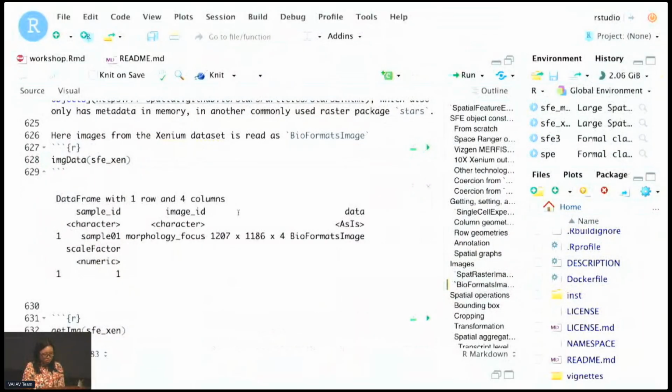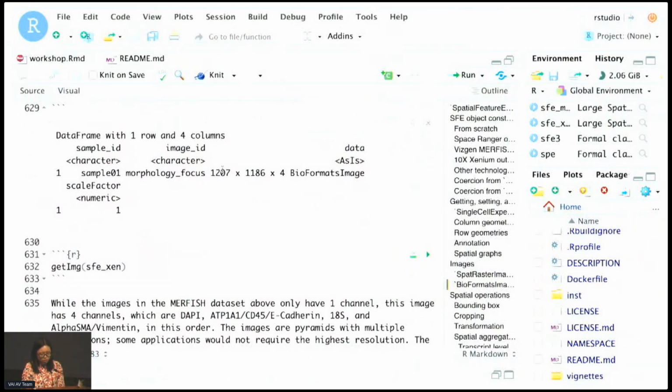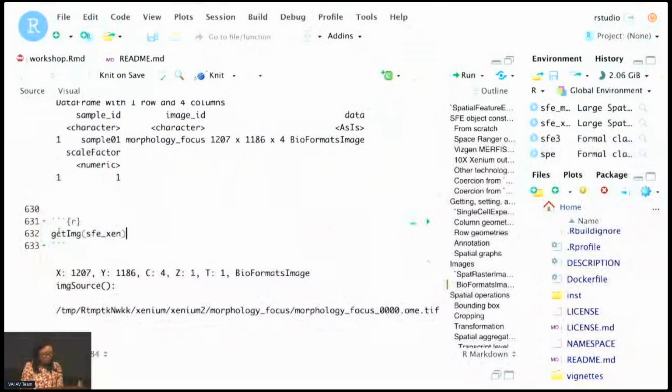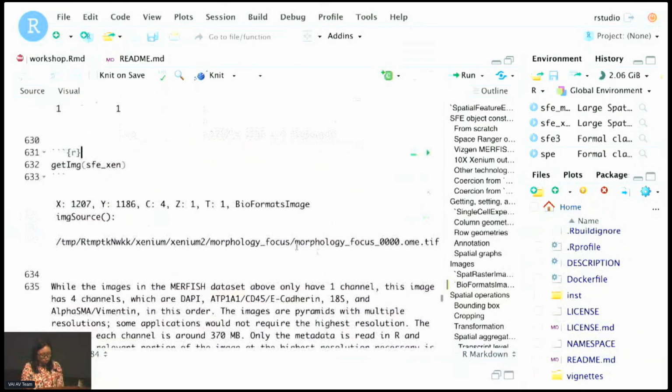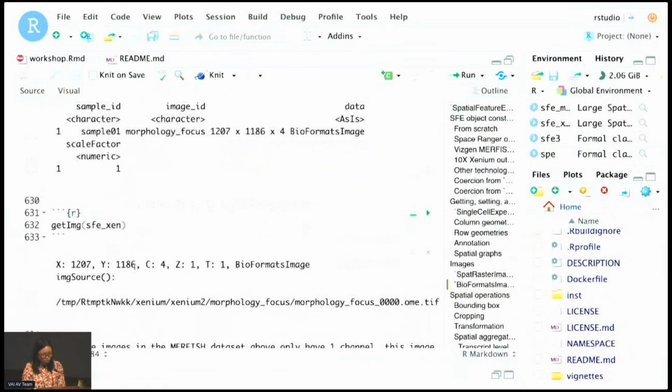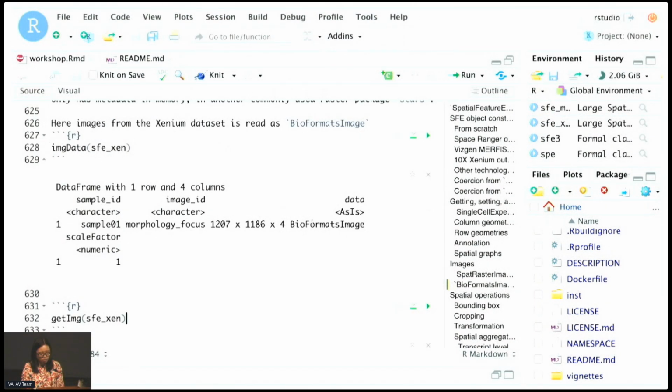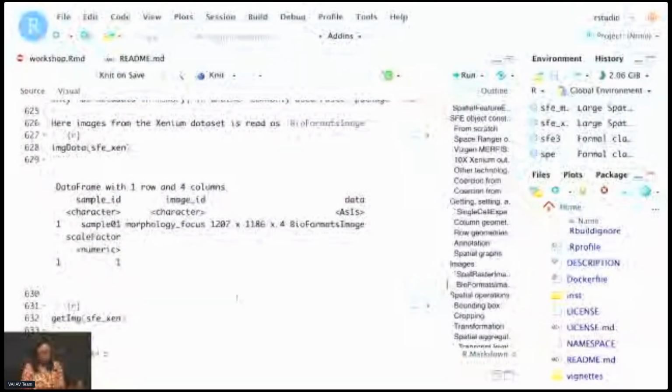Here we have an image with 4 channels, and it's a BioFormats image. I can use the getter to get this image, and it prints out a summary of the dimensions and the 4 channels. In Xenium, these images are often pretty large, and they're pyramids with multiple resolutions.